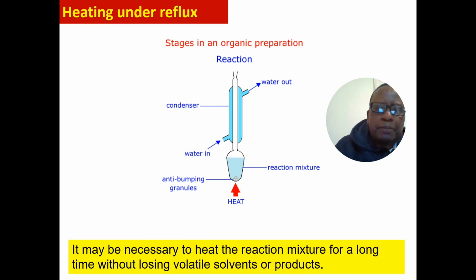And another problem is students who are not well read in their chemistry. One student was asking me, but say the granules are not melting. The anti-bumping granules are not meant to melt. They are meant to give you smooth boiling. And one very important fact about the reflux quick fit apparatus, it's called a quick fit apparatus: you don't use a naked flame.